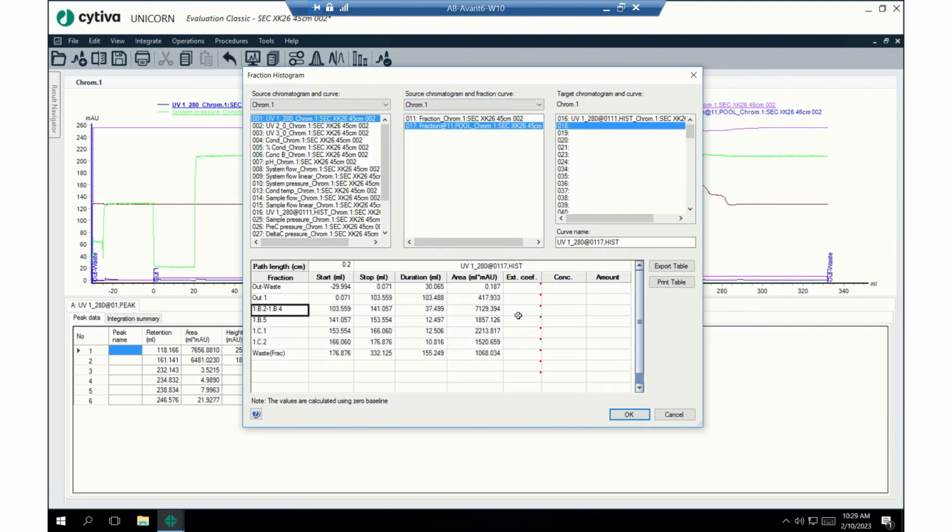So now, if I type in the extinction coefficient here, it'll give us the concentration of all three fractions together, 1.4. So I'm using 1.4, it is an extinction coefficient, but it's the absorption ratio for antibodies. And most antibodies are like 1.2 to 1.6, so I'm just using the average one. Almost all antibodies are 1.4, honestly. But your protein could be anything.